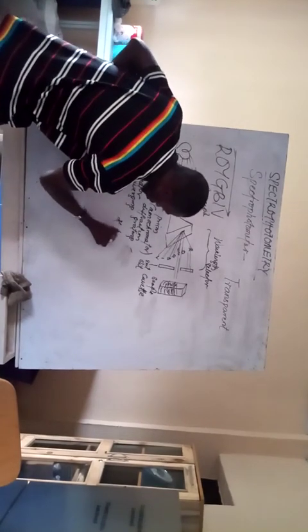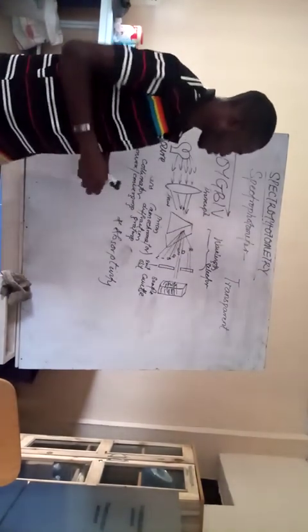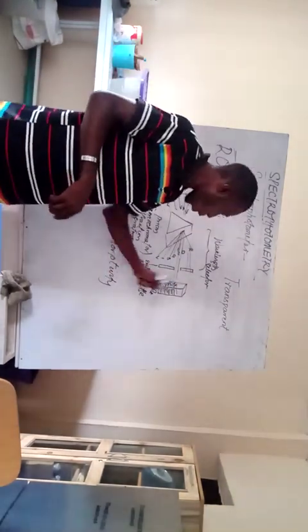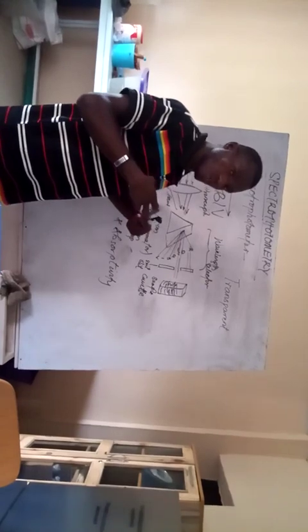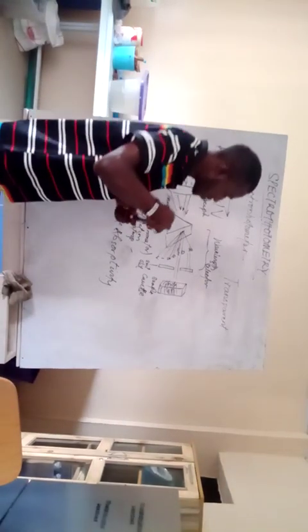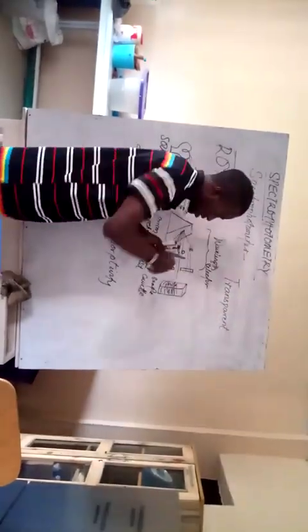That property is called absorptivity. So that is what will be called the absorbance of the material. After absorbing that particular spectrum, the remaining wavelength of light, and a portion of that wavelength of light, will leave the cuvette and strike what is called a detector.